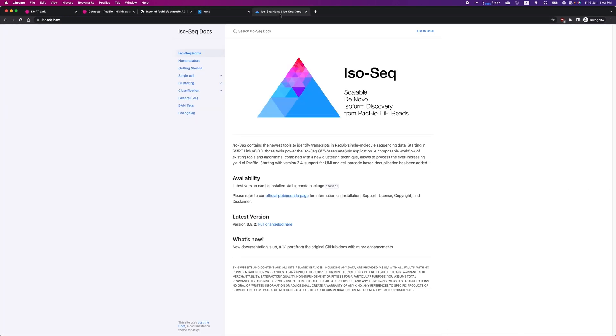Let me show you the IsoSeq.how page, where you can find documentations on how to analyze not just MAS-Seq data, but IsoSeq data in general.